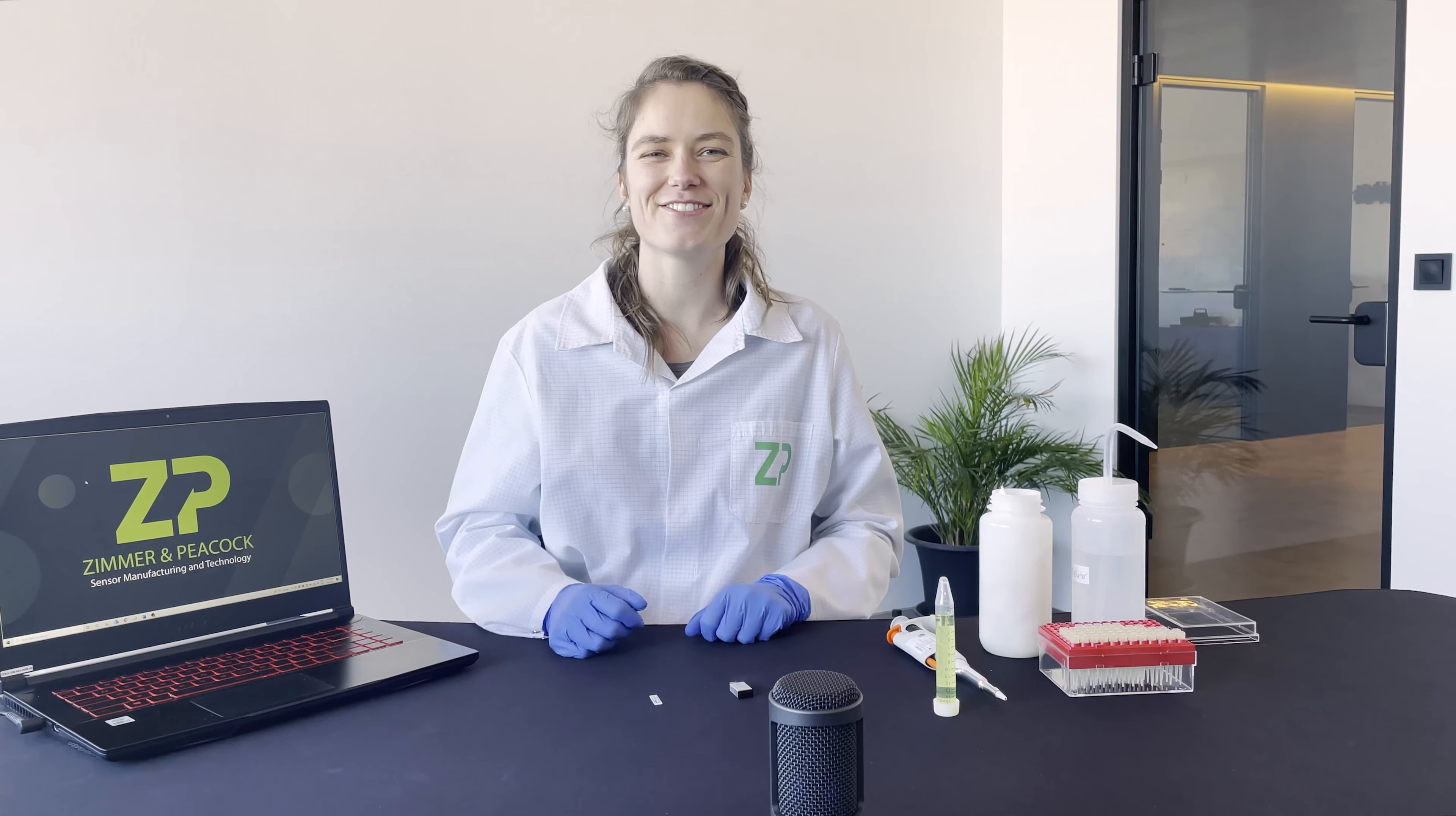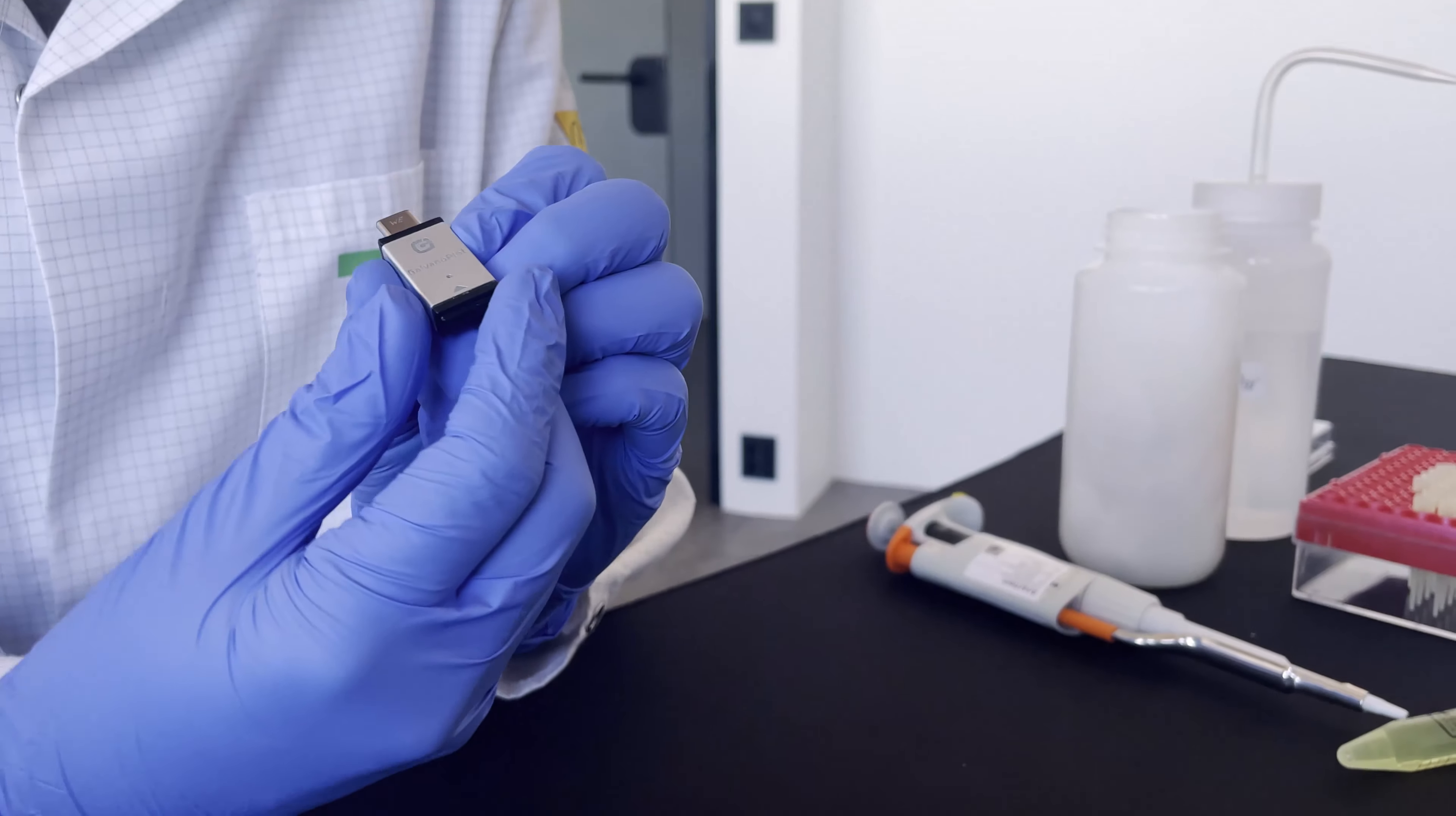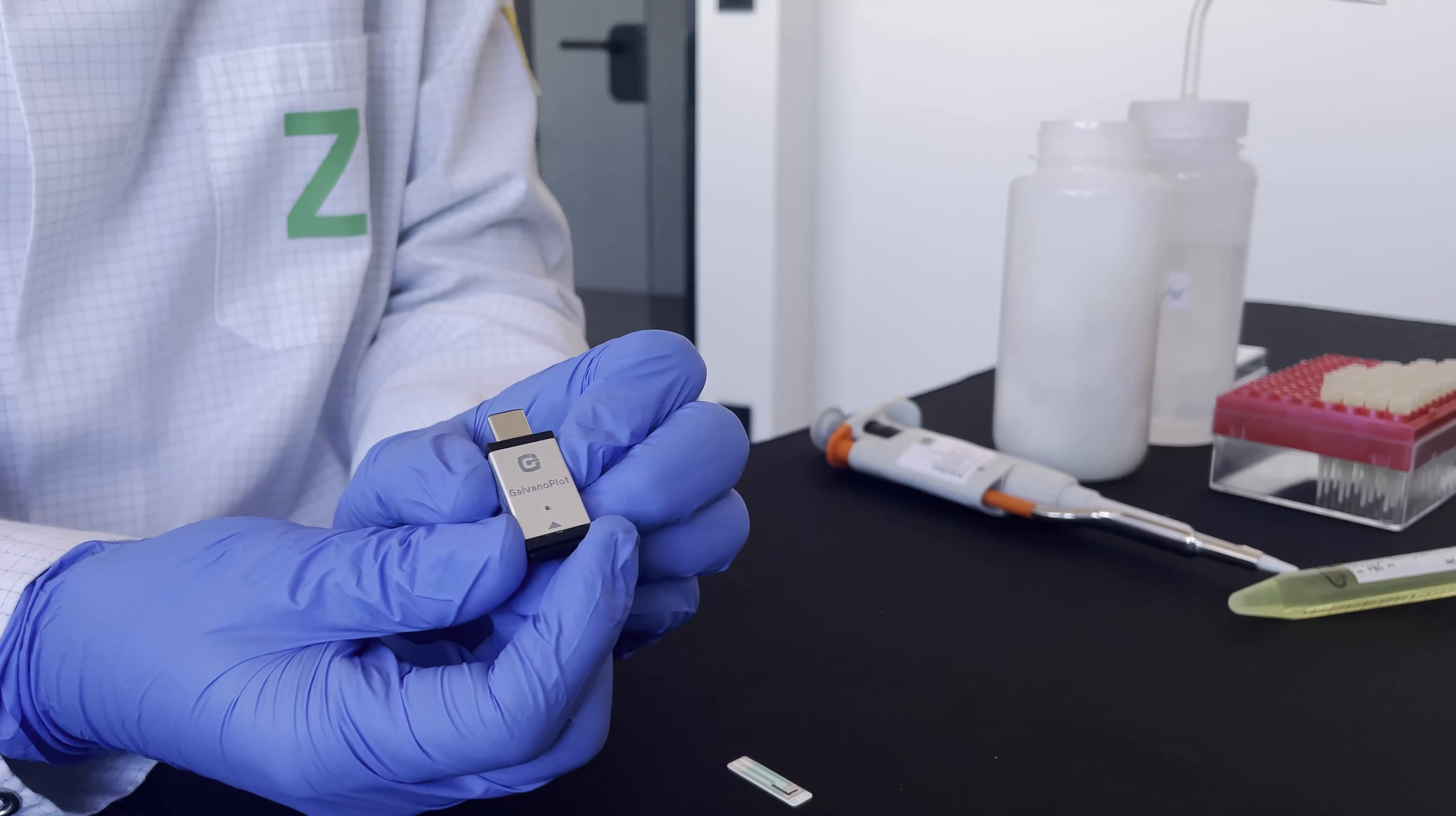Hi, my name is Solren and I'm a scientist here at Zimmer Peacock. In this demonstration I will show you how the GalvanoPlot potentiostat works with different measurements.